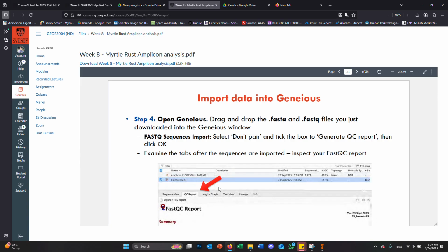In your future life, you may change your parameters. So, we're going to choose our highest quality and generate the consensus sequence. It's going to write out a new file with the same name as the original assembled file and add consensus sequence to the end of it, just for your future reference.